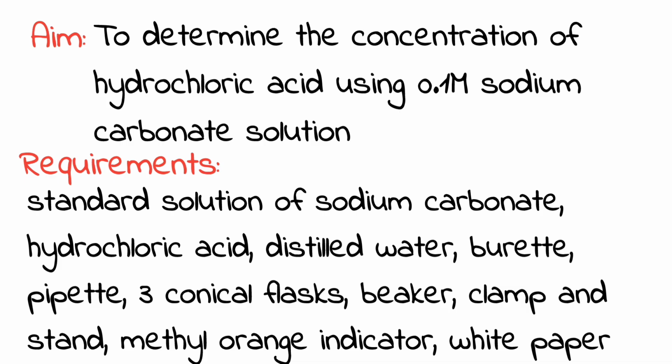Okay, why did we say we are entering the lab again? That is the aim of our experiment: to determine the concentration of hydrochloric acid using 0.1 molar sodium carbonate solution. That is the standard solution we prepared last class. Let's start gathering our equipment.